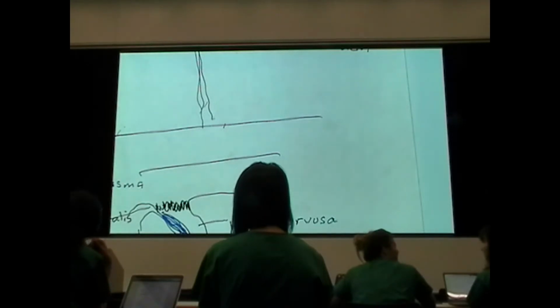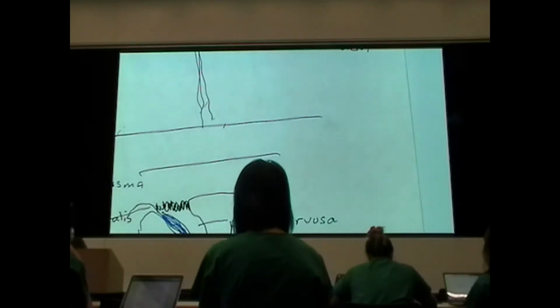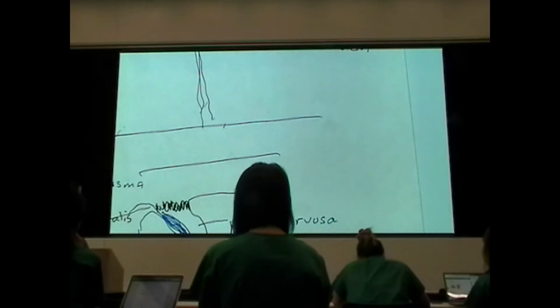Well, the connection is false, but the tubule has some lumen in it, and some bits of that lumen are often preserved in the pars intermedia, so that if you examine it in a light microscope, you will see that in the pars intermedia there are some follicles that are present.